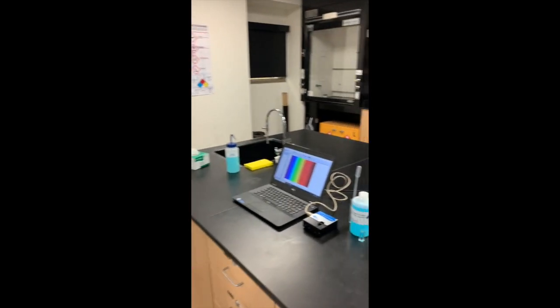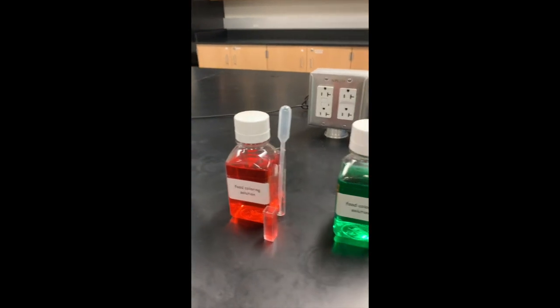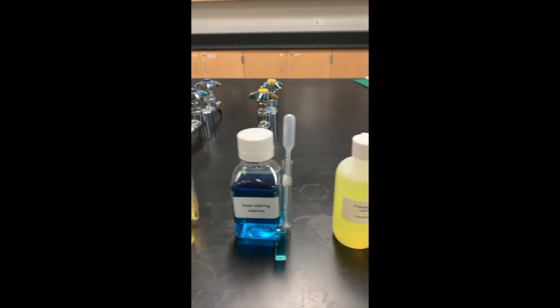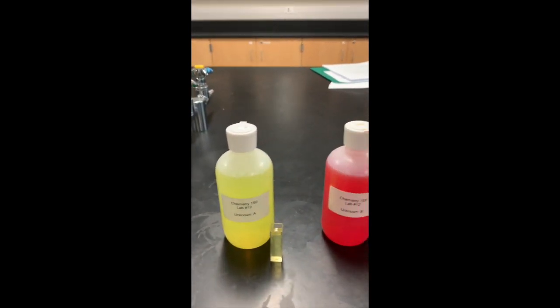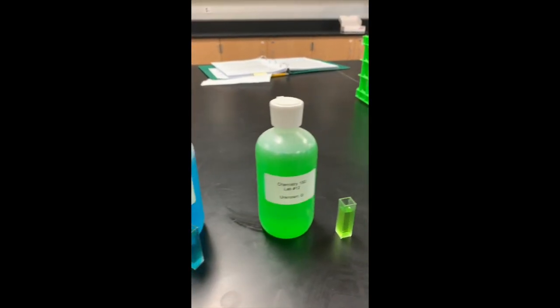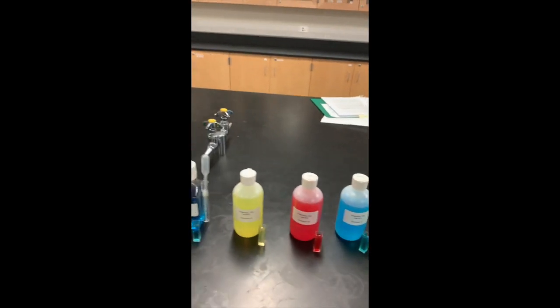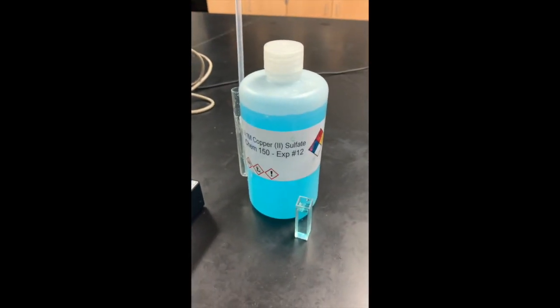So we have a bunch of food coloring dyes that we're going to use. We have red, green, yellow, and blue. And then we also have some sports drinks that also have some of these materials in them. You can kind of look and guess the particular dyes that are in there, but we're going to use the spectrometer to prove which ones are in there. And then also one of these sports drinks has been contaminated with copper sulfate. So we should be able, through spectroscopy, to figure out which one that is.